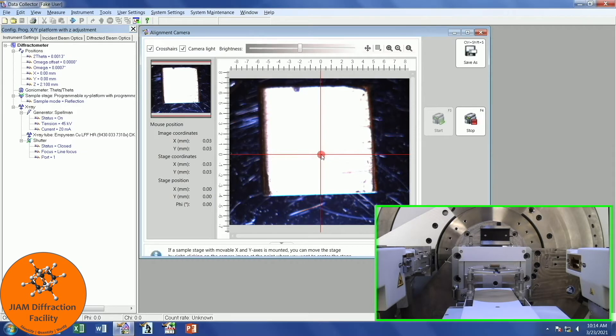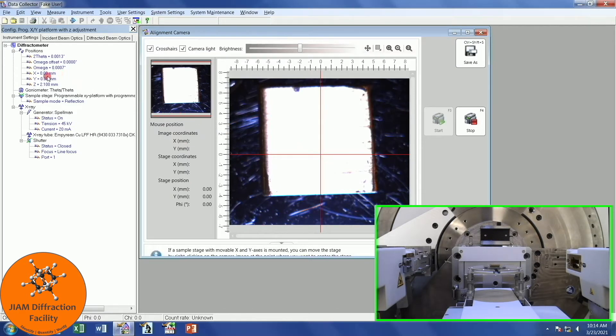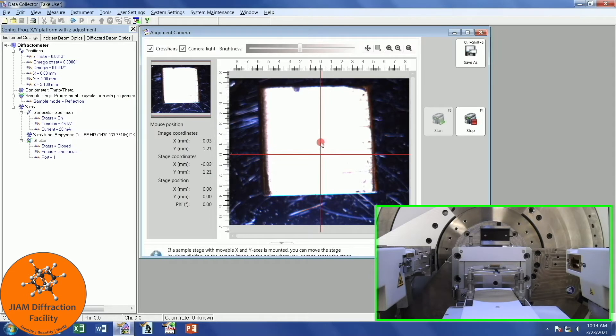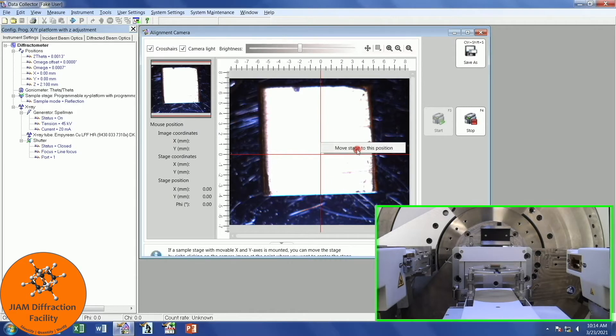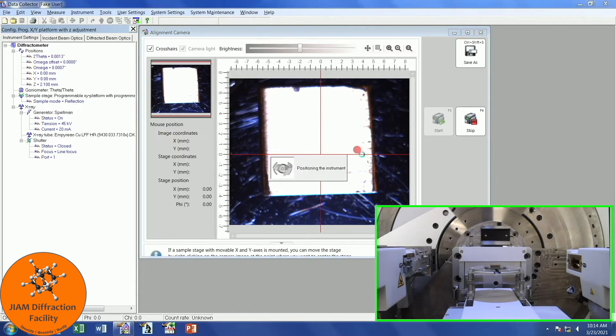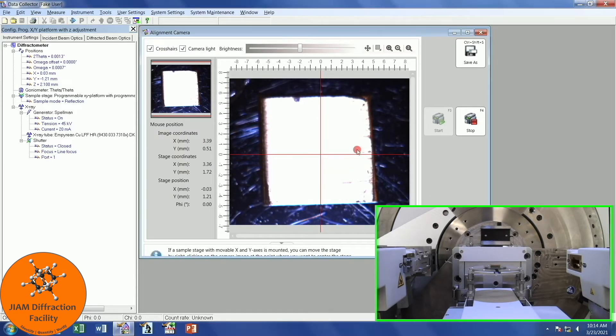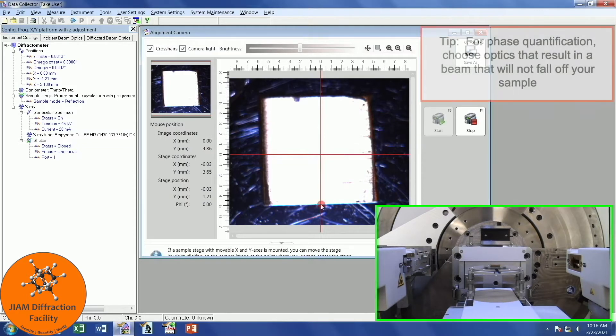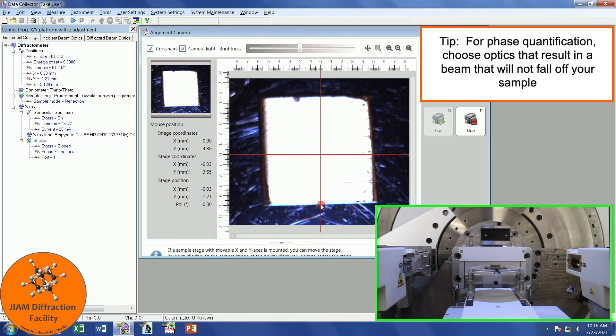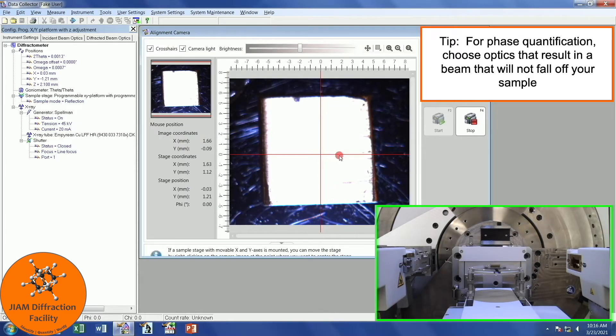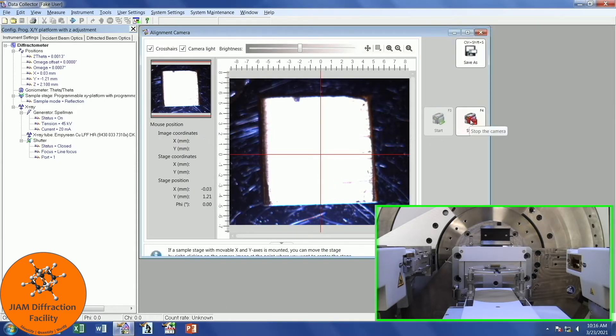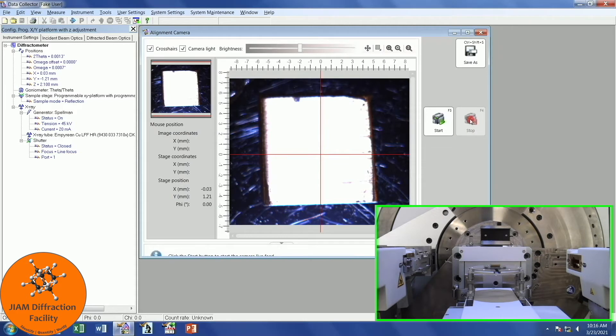Here we see our sample. The crosshairs show you where the center of the X-ray beam is. I'm a little off-center. You can see that I am currently at the 0, 0 position. If I right-click, I can choose Move Stage to this position, and now you will see the sample shift. Now it is better centered. For this sample, I just want to perform phase identification, so I don't really care if the beam falls off of my sample, so this is good enough for me. I will left-click stop, and then I will close this window.